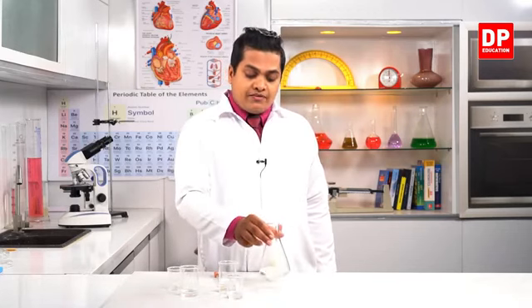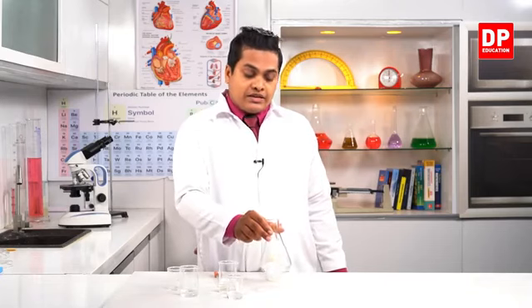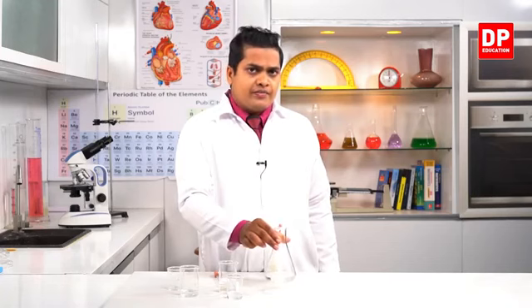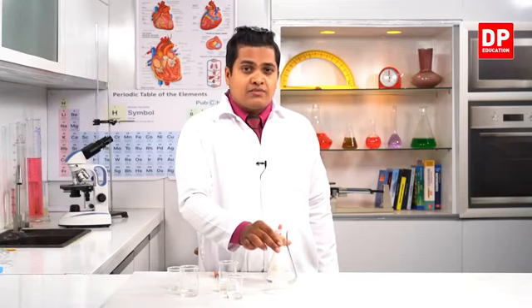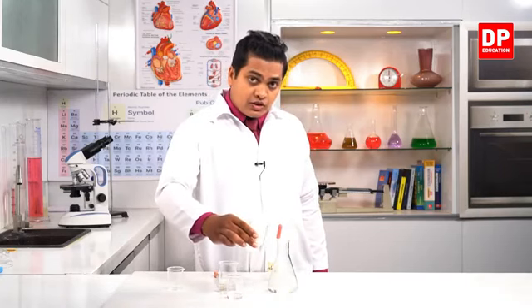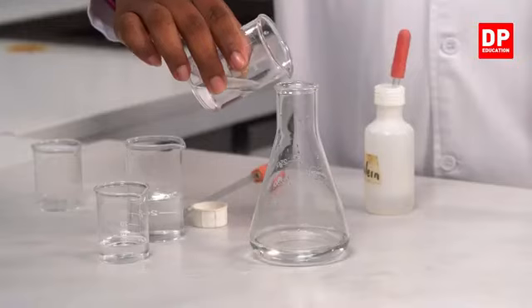Now this is the solution that we have right now. I told you that this solution is now colorless. Earlier it had a pink color. Now it is colorless because it is a neutral substance right now. That's why phenolphthalein can't give any color change, because with neutral substances, phenolphthalein can't give any color change. So I'll add just 1 or 2 drops of sodium hydroxide solution back to this solution once again.